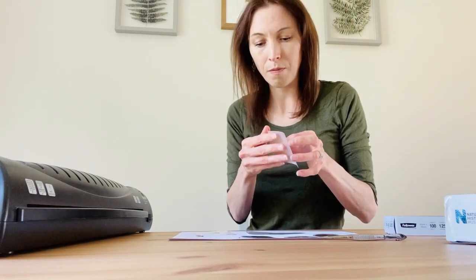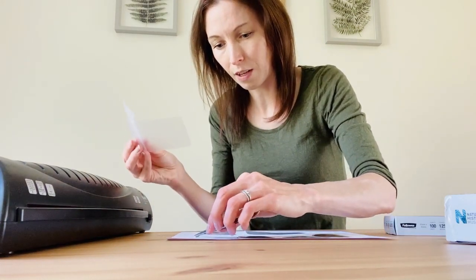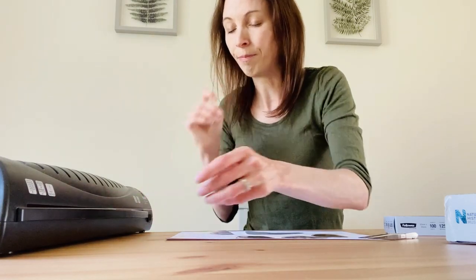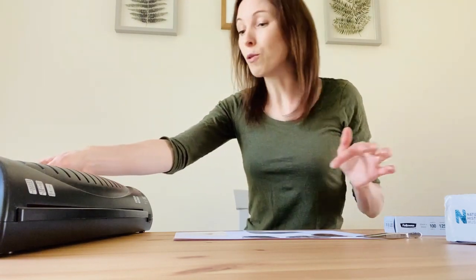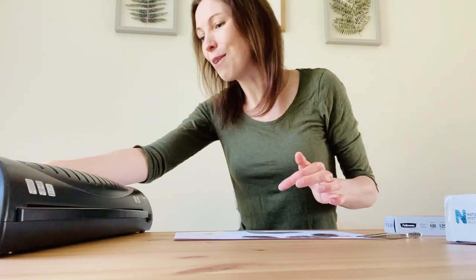I just bought these laminating pouches off Amazon so they weren't difficult to get hold of. I'm just going to pop the little wing in and feed it through the laminator. Here in the UK at the moment it's summer, which is a really good time to look for natural death insects — if you've got a conservatory, have a look around the windowsills. And if you have obliging friends who are happy to keep dead insects for you, that's great. There we go — another perfect one. We've got our hoverfly wing inside the laminate. I'm going to turn my laminator off.